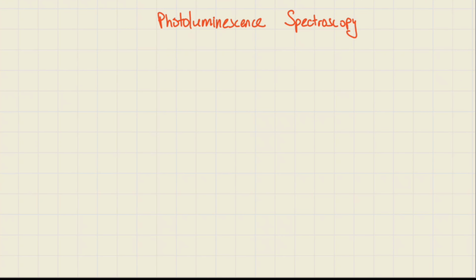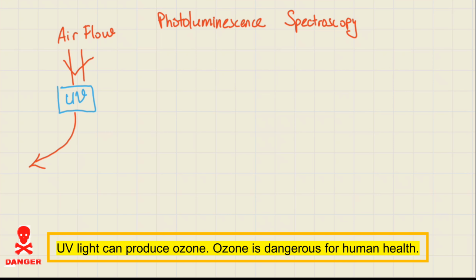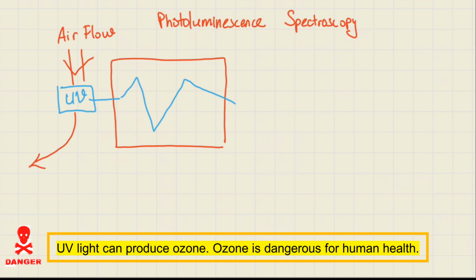To do photoluminescence spectroscopy, we need a spectrometer, and it is a complicated system. First, we generally use a UV source. So we have a UV light source, and this source is actually pretty strong. We may need to cool it. So there is an airflow, and this airflow cools the lamp. We have an excitation monochromator, and light passes through the monochromator. We may use a filter.